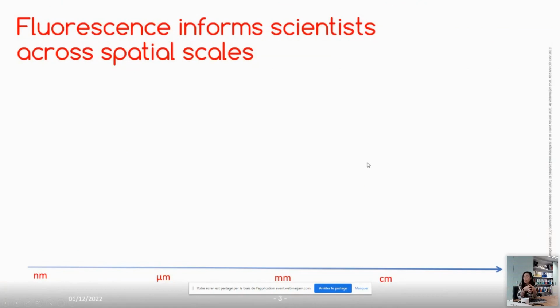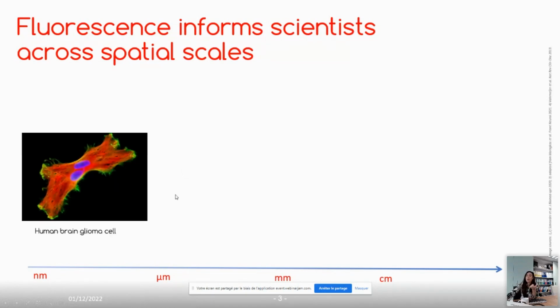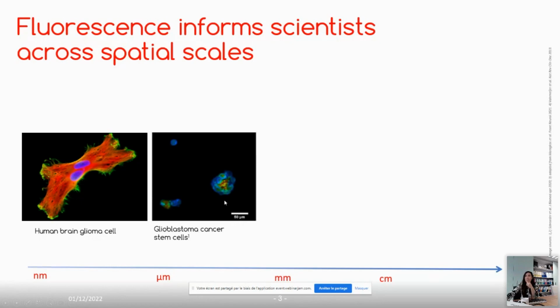And particularly with today's focus, we're going to be discussing super resolution related to fluorescence microscopy. Fluorescence as a physical phenomenon is one of the most flexible and dynamic ways of being able to generate contrast and study biology. Starting with subcellular structures at the nanometric scale, we can see how individual proteins, mitochondria, and organelles interact within a single cellular environment.